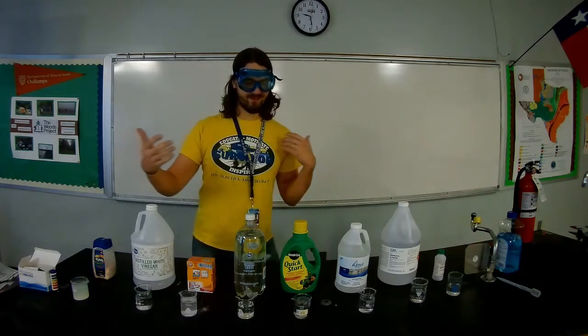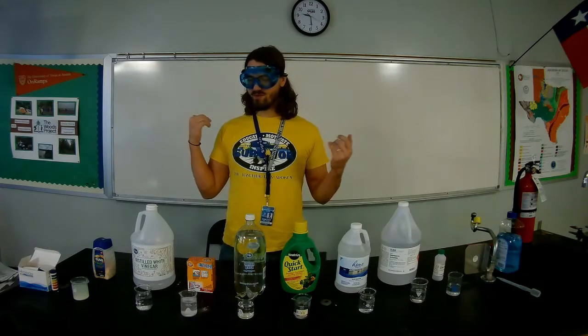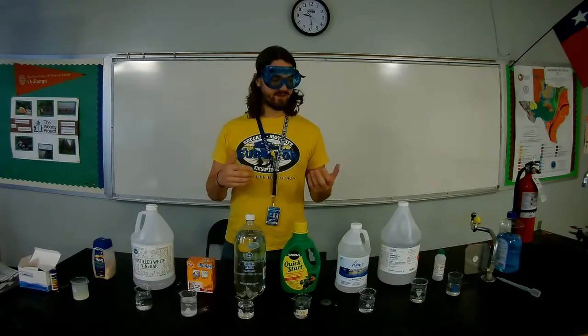So you're going to follow along and make observations about the different chemistry that we're doing today. And our lab today is going to be about acids and bases and chemical reactions. And basically, we can't do hands-on labs this year. Obviously, we're doing virtual stuff. But what we can do is you can watch along as I do different things and make observations and answer questions as we go through.